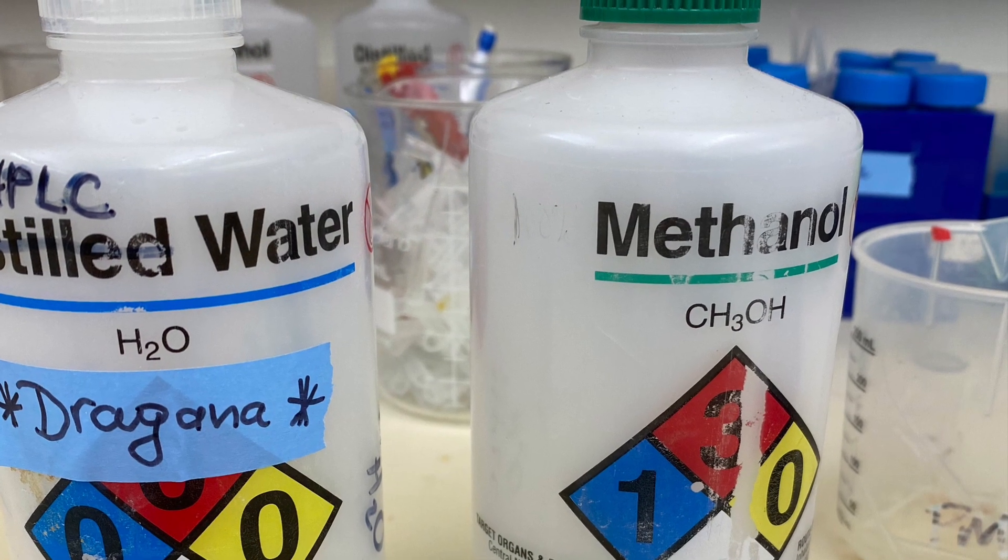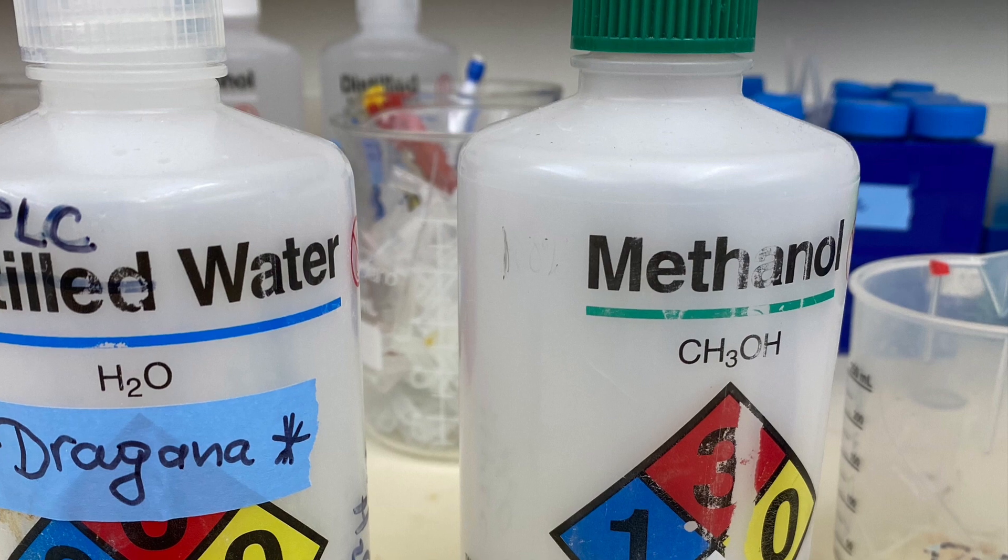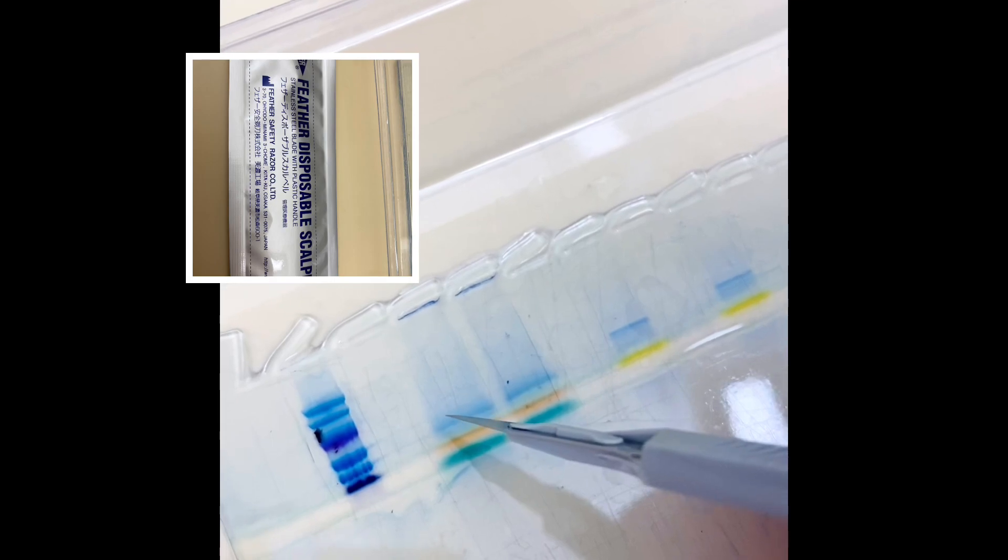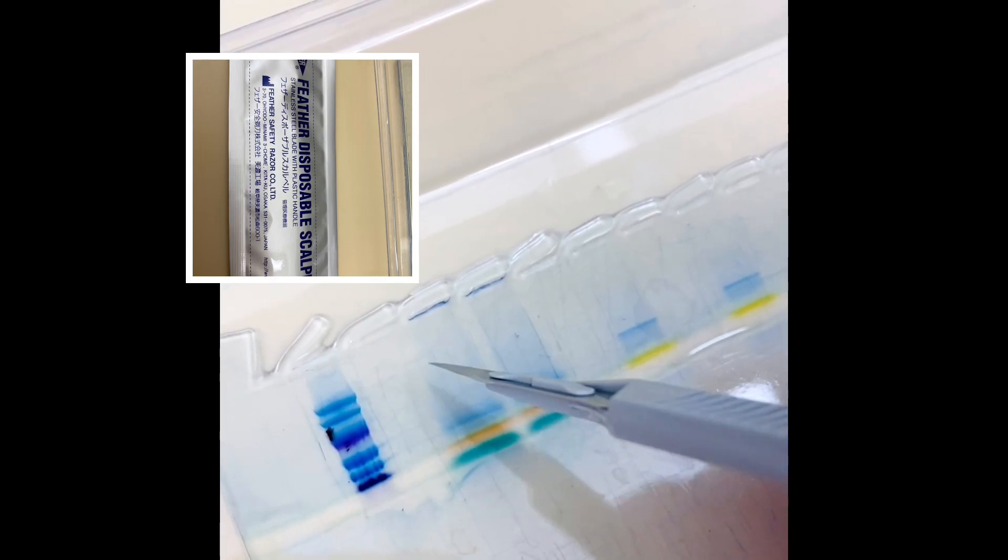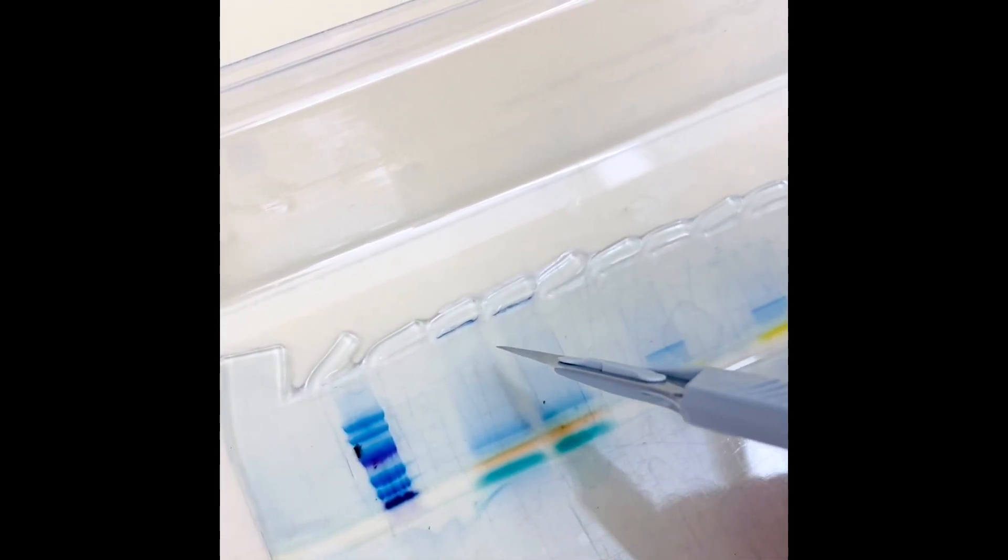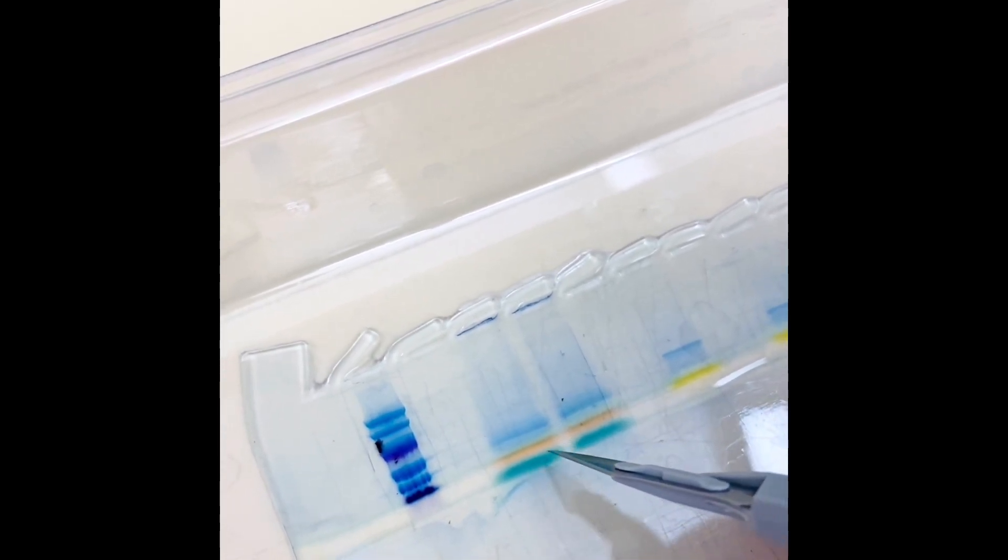To cut the bands out you will need HPLC grade water, methanol and the scalpel. Between cutting each lane or band you want to clean your scalpel with water, methanol and then water again. When you cut your gel out and put it in the tube make sure, and this is very important, to cut that gel piece into little cube pieces using your scalpel.